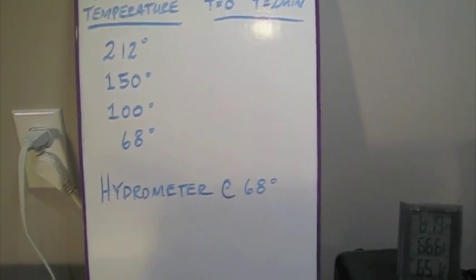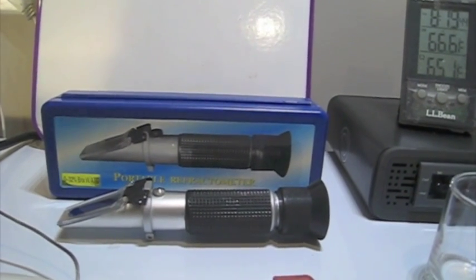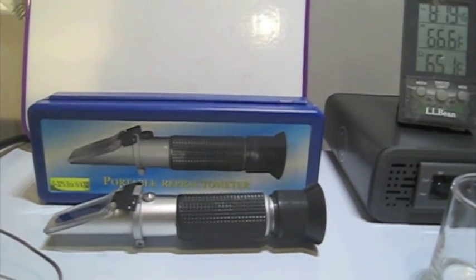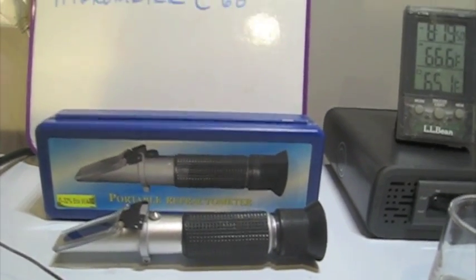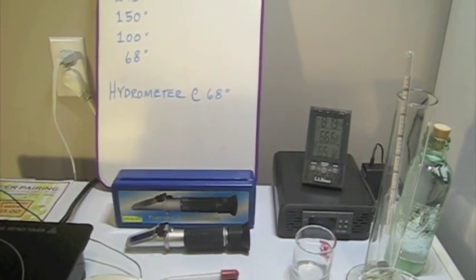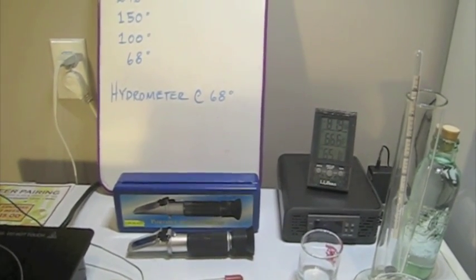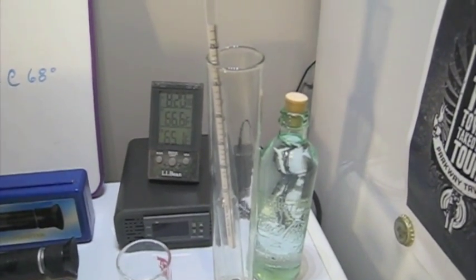I'll also mention that prior to doing any of this, I've already calibrated the refractometer with some distilled water to make sure it's zeroed out exactly right. And so again, I'm interested in the accuracy, but also the repeatability using the refractometer versus the numbers that we're going to see with the hydrometer.